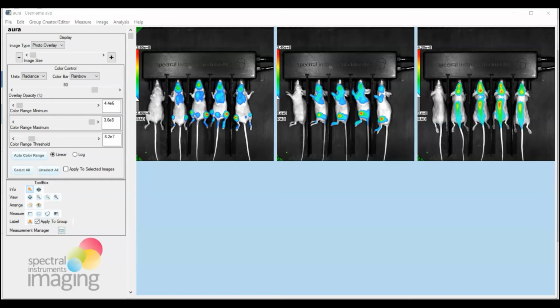Next, we will summarize how to make and apply background ROIs to your test ROIs in those rare instances where you may need to correct for any significant background signal. Then we will show you how to draw ROI templates that can be saved and applied to multiple other images and avoid the need of redrawing sets of ROIs.